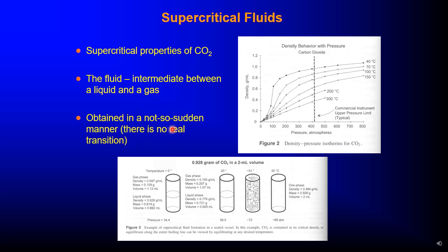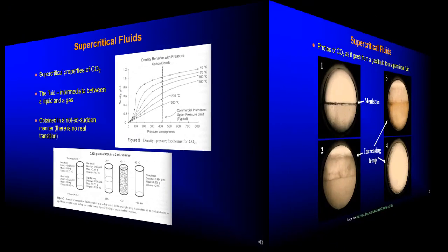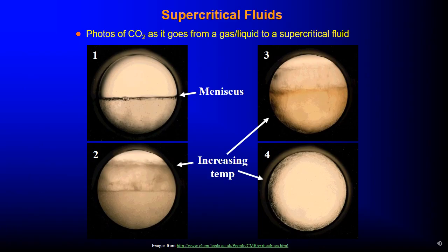There is no real transition, so you can see photos of carbon dioxide as it goes from a gas and liquid to a supercritical fluid.